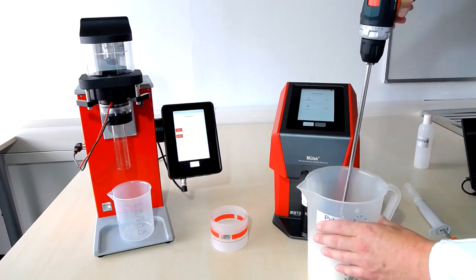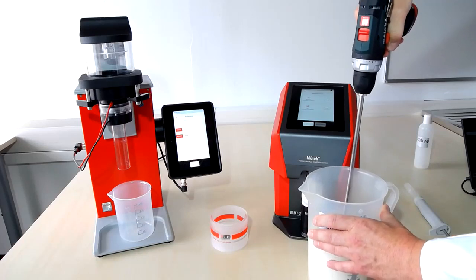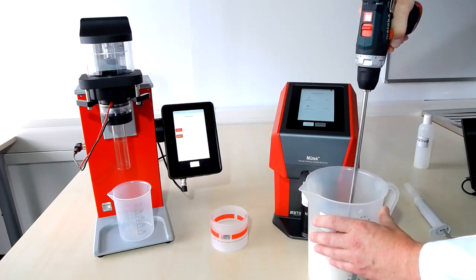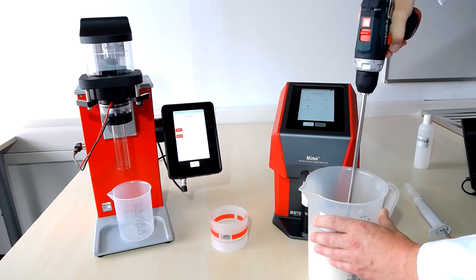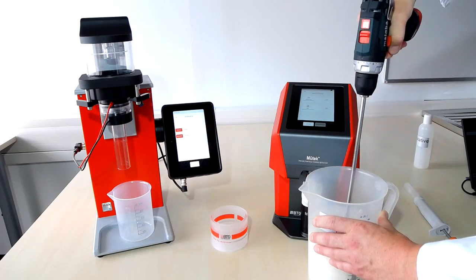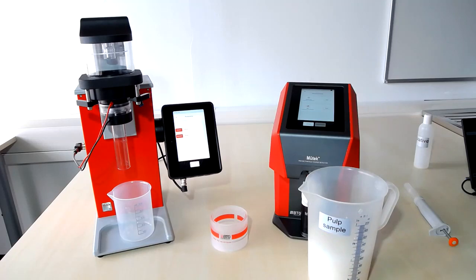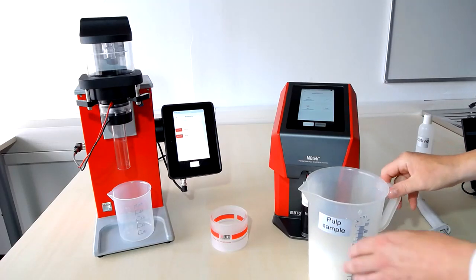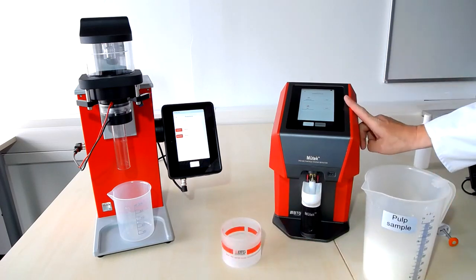And after adding the fixative, we need a couple of seconds of good mixing. Enough for today. And I'm suggesting to start with a PCD measurement.